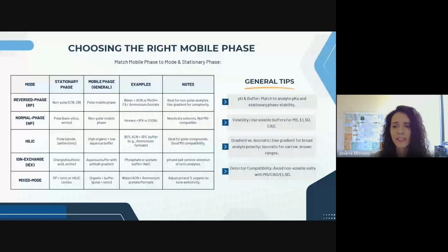So in short, the mobile phase is not a one-size-fits-all decision. It should be selected based on separation mode, the chemical properties of your analyte, and the detection method you're using. So the table on this slide is just a helpful reference when developing or troubleshooting a method.